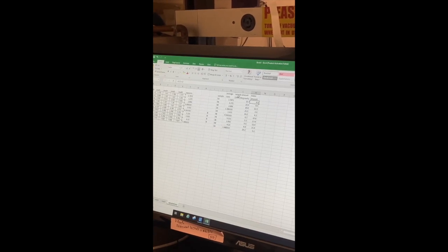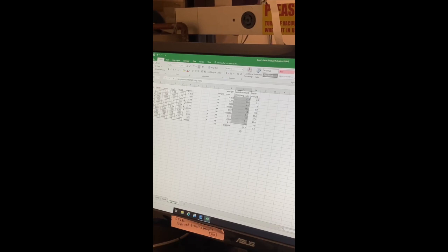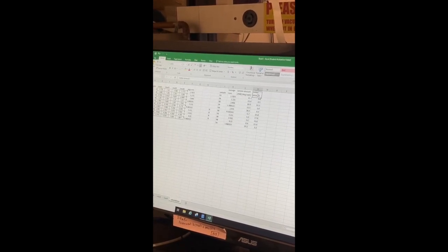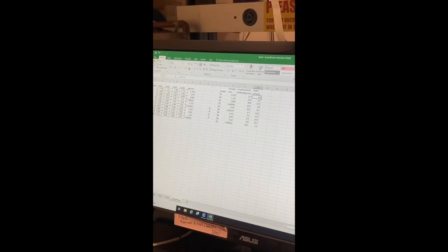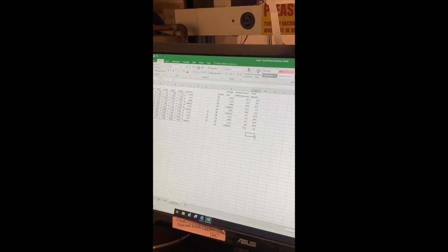So I know I have to have a defined amount of the sample in order to run the blot, because that's the whole point of the Western Blot. And then the water is just like a buffer. So I do the 22.5 minus the amount of sample that I have, and that tells me the amount of water that I have.